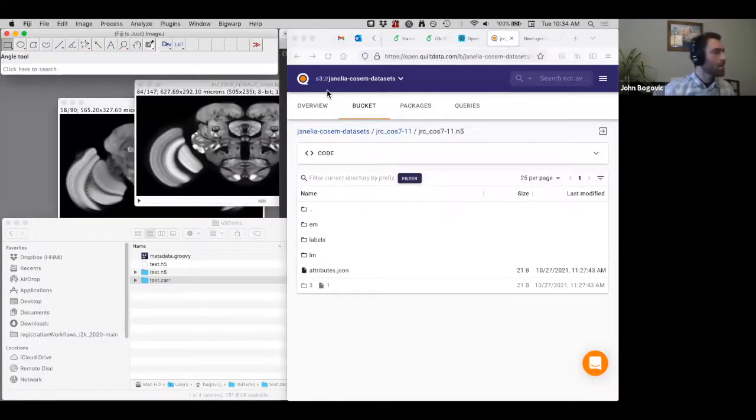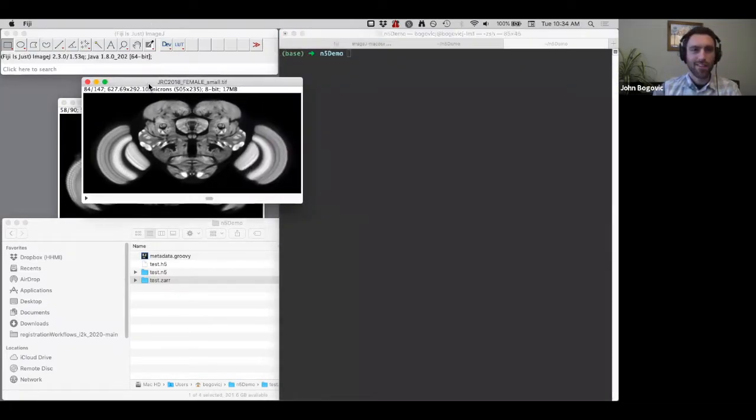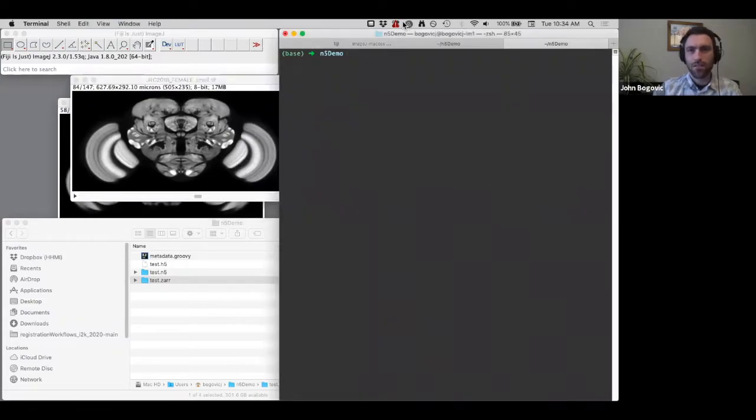Okay, let's see. I'll show two others. I'll show 2 other small things, I think, and then I'm gonna maybe open it up to a larger discussion if that's okay. So the first thing that I think I'll show is a small demo. And I said earlier, this is just a little bit of fun.